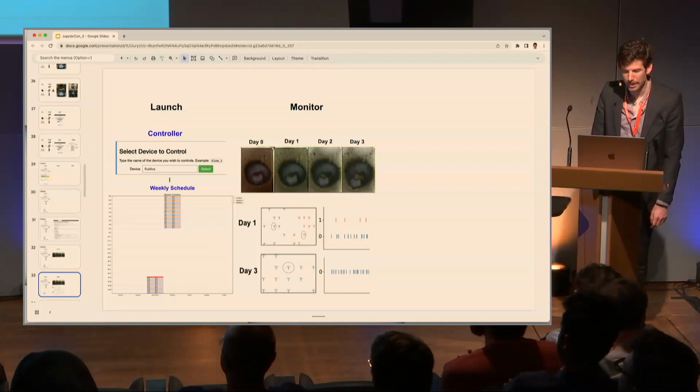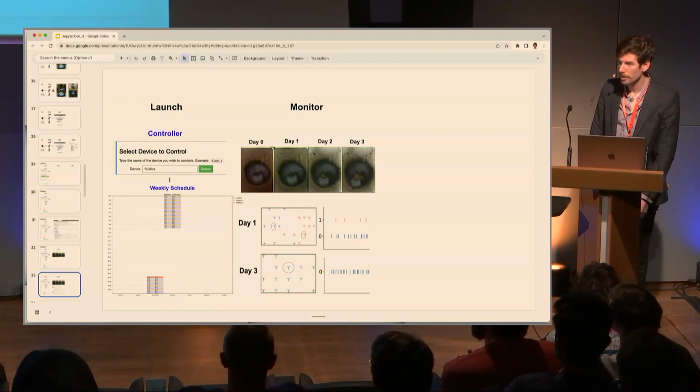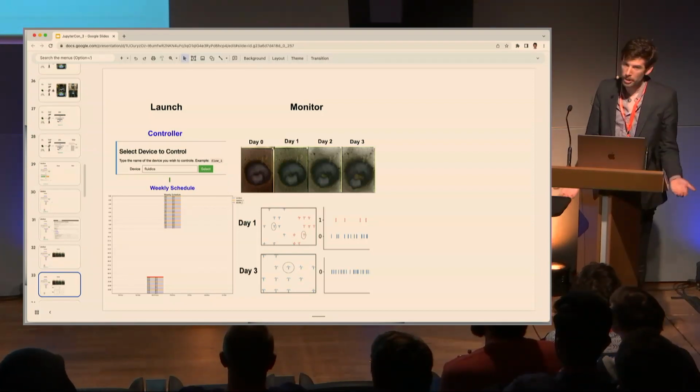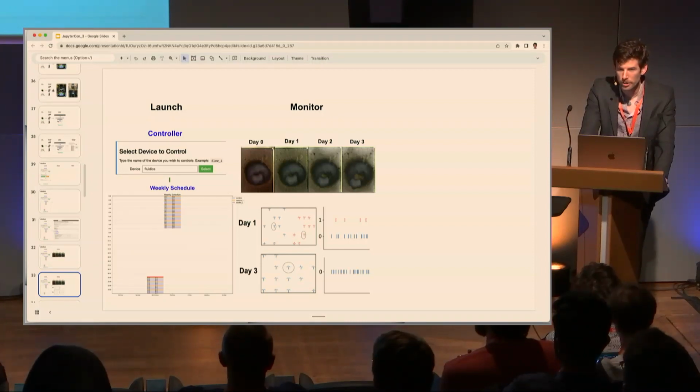To give you an idea, that brain-computer interface for a single cerebral organoid running for 1 day is about 1 terabyte of data. So you run it for 2 weeks, they're talking 14 terabytes of data per organoid that has to be analyzed automatically and given to the user every hour, or let's say every 2 hours.